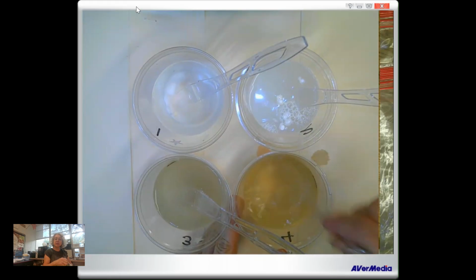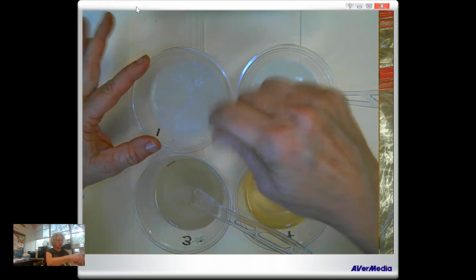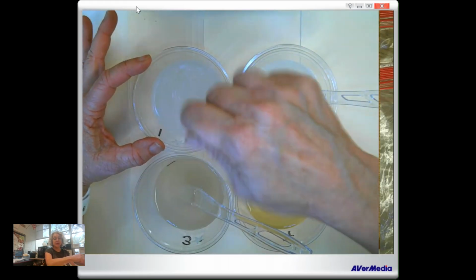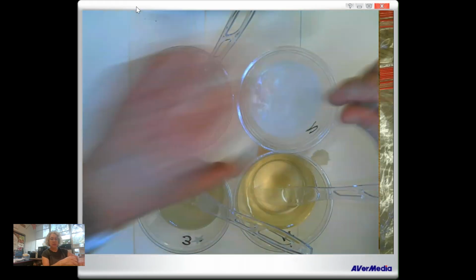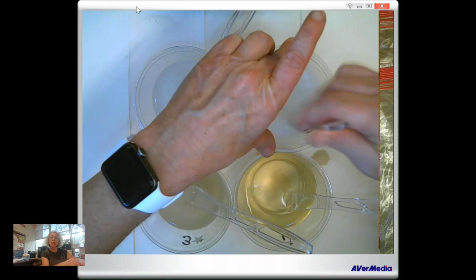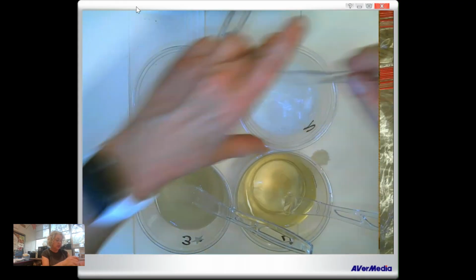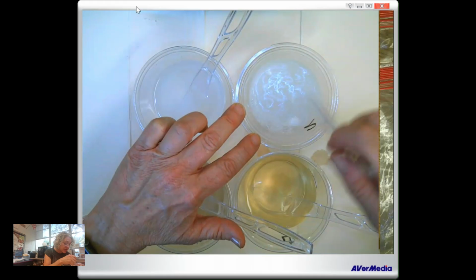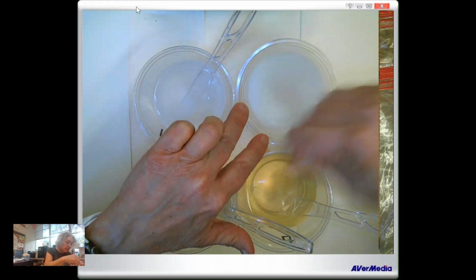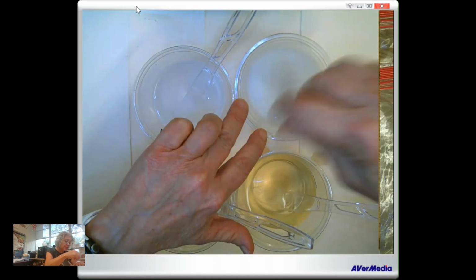And of course, for things to dissolve, it'll take a while, won't it? You know, the faster you stir something, the more quickly it dissolves. Also, the hotter the water is, the faster it will dissolve. But will everything dissolve? That's what we're testing, right? Solubility, the ability to dissolve. Well, that's got chunks. Come on now, chunky. Chunky monkey, number 2. This is number 2. Looking kind of milky in there, kind of cloudy, right?